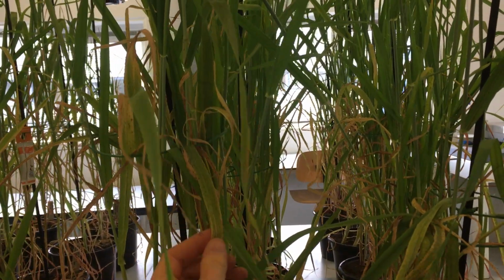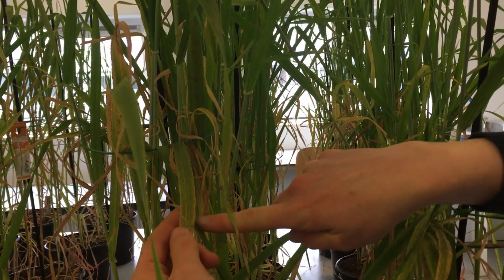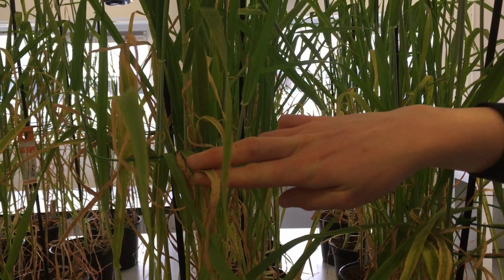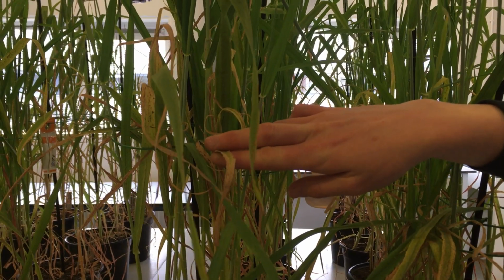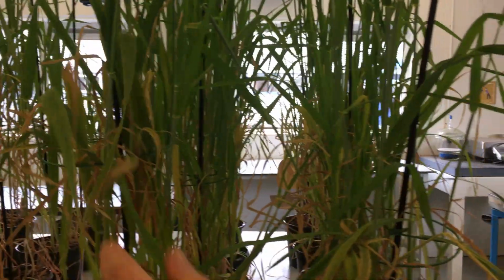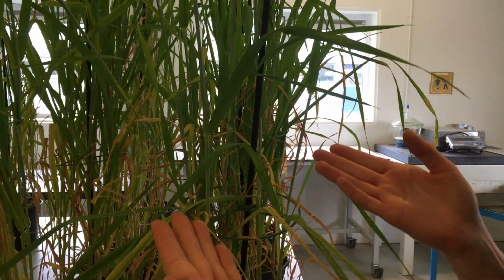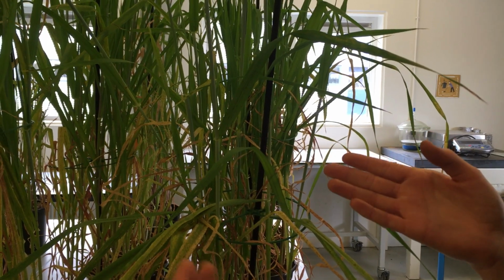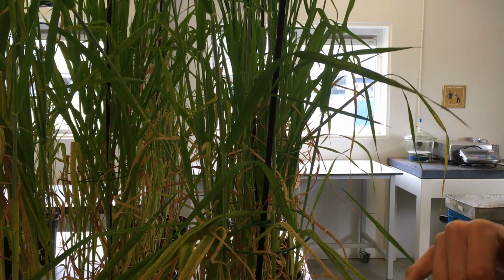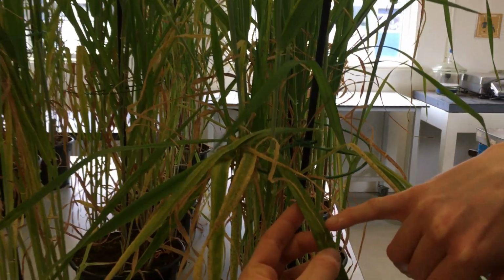So this is just old age. These leaves are old. Pretty soon they'll be like these brown leaves, and they have these black dots on them. And this plant also has black dots because some of its leaves are also aging, but you also see leaves which are inoculated with the rust.